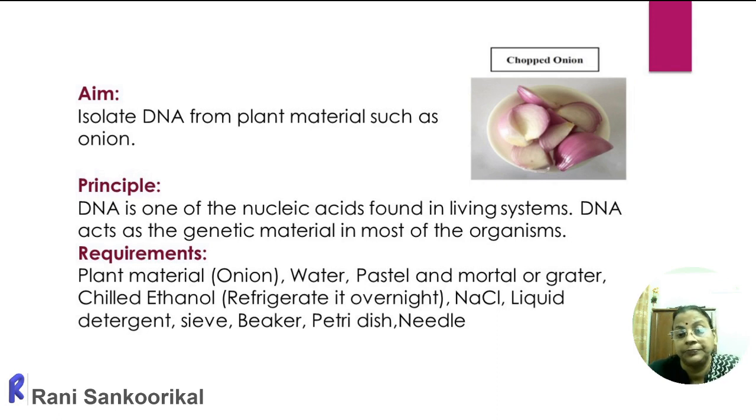The plant material is made up of cell wall and cell membrane, so first we have to break the cell wall and cell membrane. For that we can do the lysis step. So what do you mean by lysis?